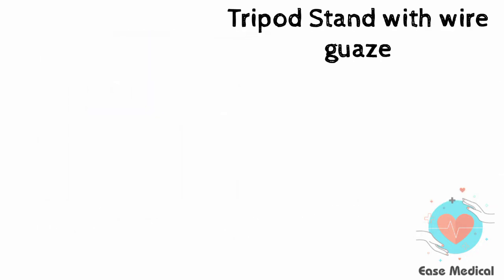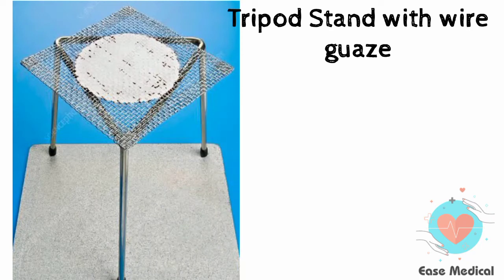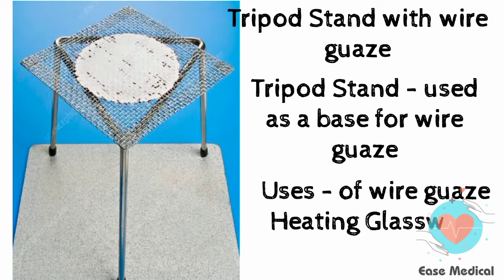Next, porcelain dish or basin, made up of porcelain, used for evaporation of liquids at high temperature. Now, tripod stand and wire gauze. Wire gauze is placed over the tripod stand, so the tripod stand is used as a base for the wire gauze. Wire gauze is used for heating glassware substances, since they cannot be heated directly from a Bunsen burner.